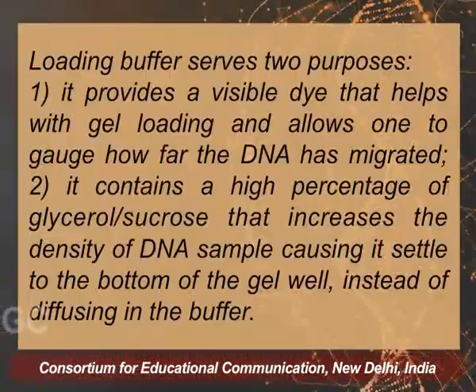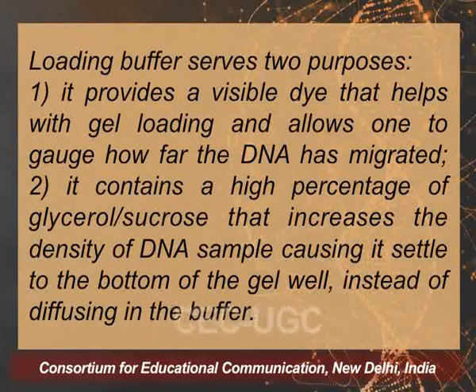So, the loading buffer is added to the DNA sample which needs to be visualized, or to the DNA fragments which need to be seen on the gel. The loading buffer serves 2 purposes. It provides a visible dye that helps with gel loading and allows one to gauge how far the DNA has migrated.